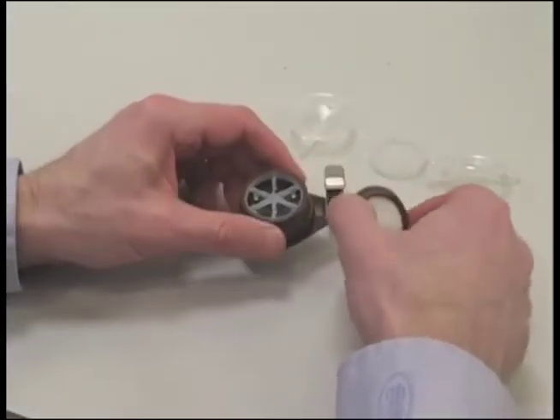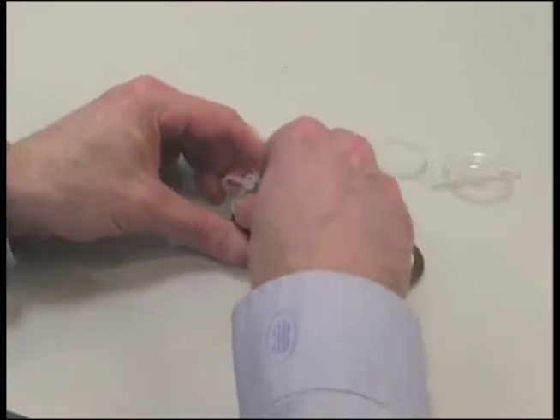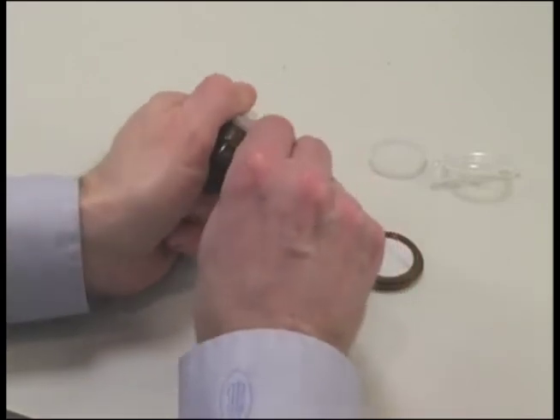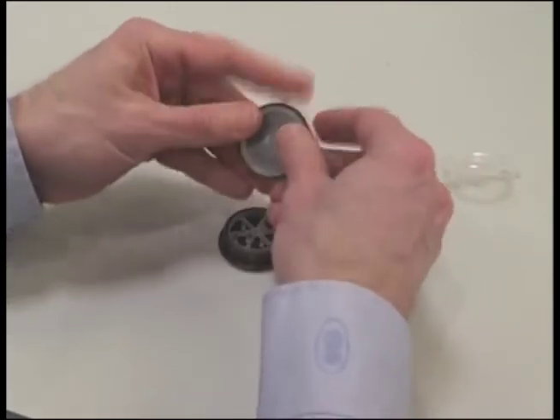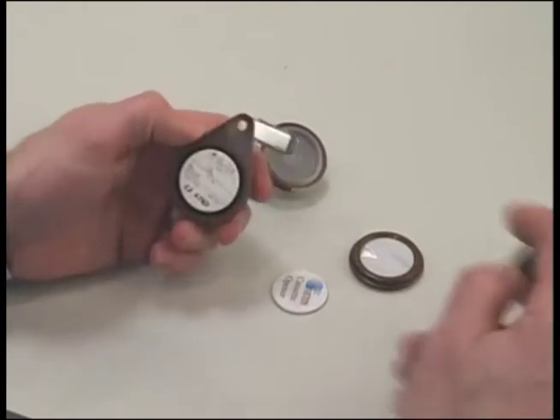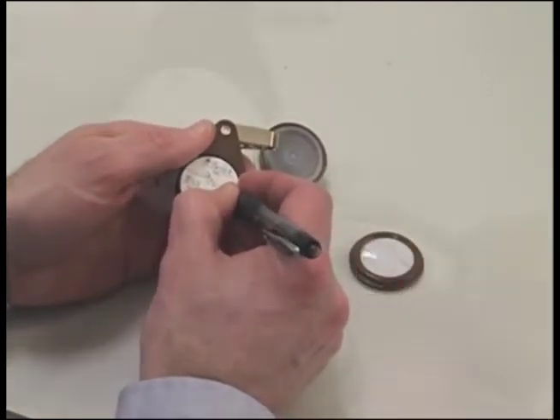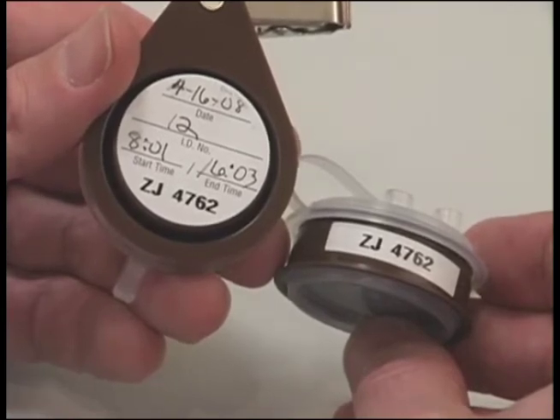When using the 3M Organic Vapor Monitor with backup section 3520, snap an elution cap with plugs onto the top of the primary body. Separate the primary or top body and secondary or bottom body sections by pulling or leveraging them apart. Snap the bottom cup, then snap the remaining elution cap onto the top of the secondary body. Record the final sampling time on the back of the monitor. Note: the primary and secondary sections should have the same identification numbers on the two halves. Do not mix different monitor sections or the analytical results will be compromised.